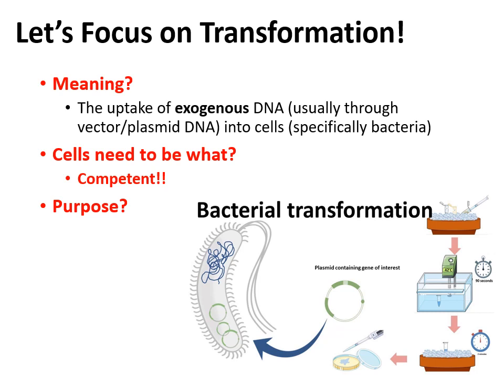Okay? Now, in order to do this, cells need to be competent, okay? Unlike a lot of students I know.